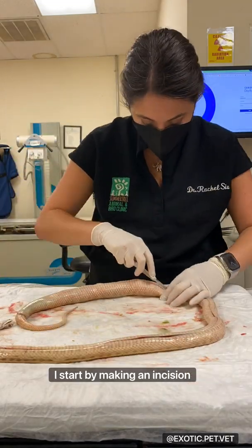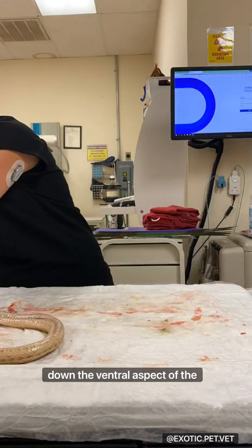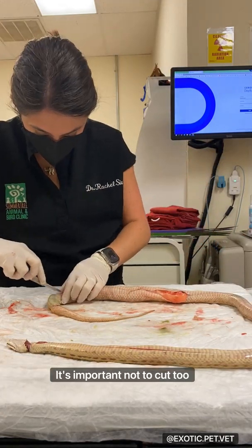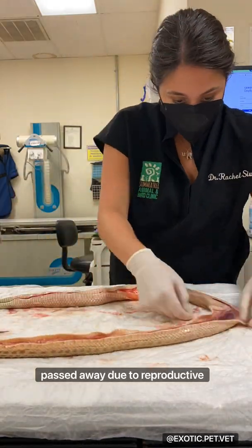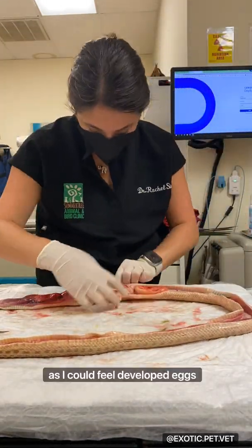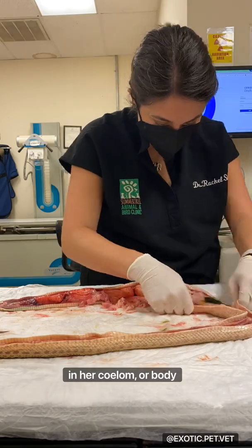I start by making an incision through the scales all the way down the ventral aspect of the snake. It's important not to cut too deep or you risk puncturing the organs beneath. I'm suspicious that this snake passed away due to reproductive disease, as I could feel developed eggs in her coelom, or body cavity.